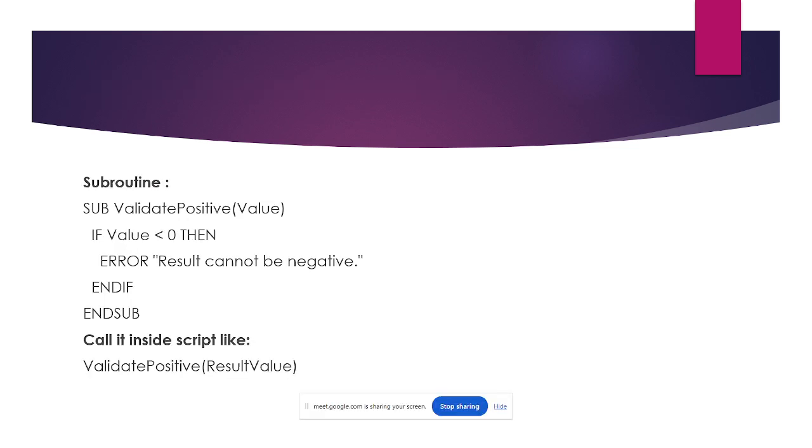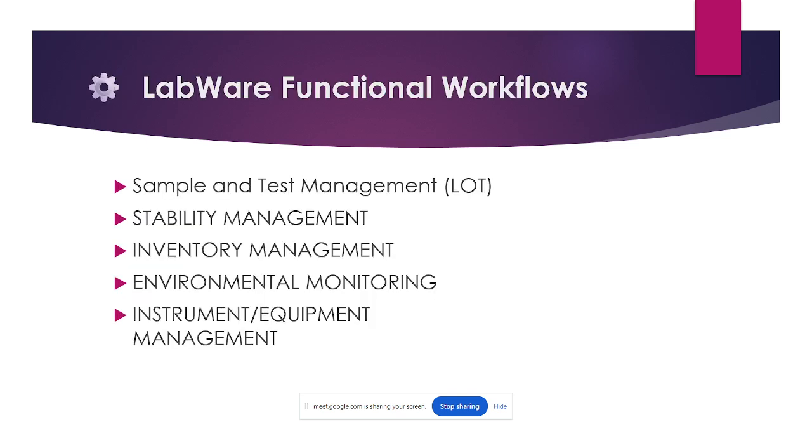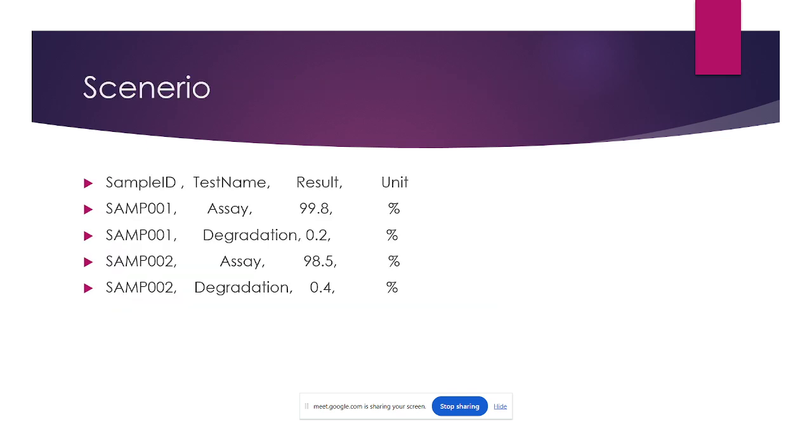This is the same as what I explained just now. This is the test case scenario. I told you, whatever the sample requires, those sample tables and test names will all trigger first in the initial subroutines. After the subroutines, based upon the parsing script, the results will transfer to the parsing script.